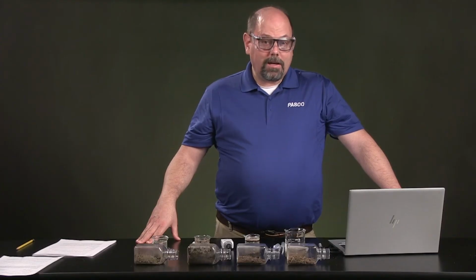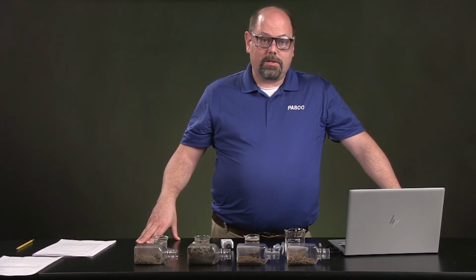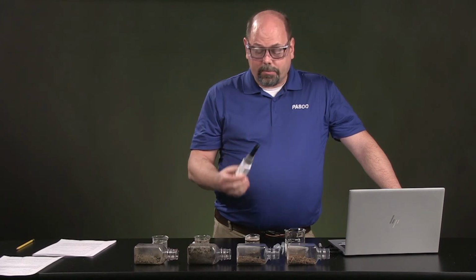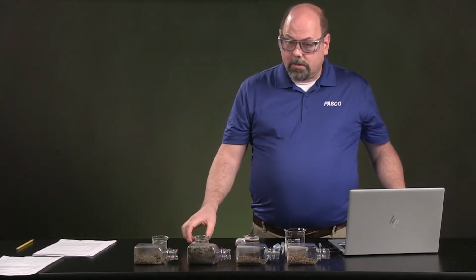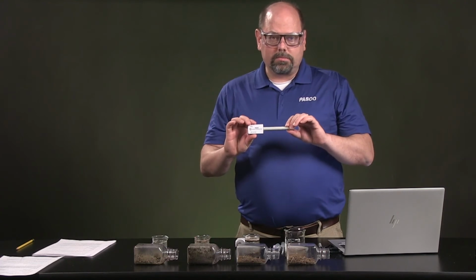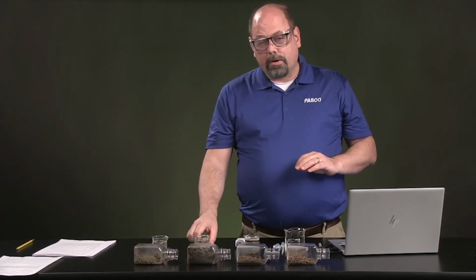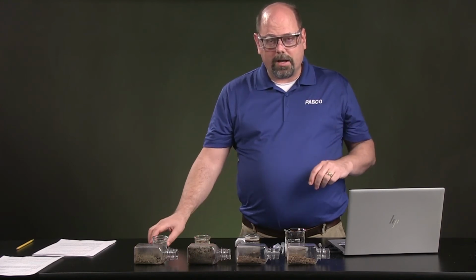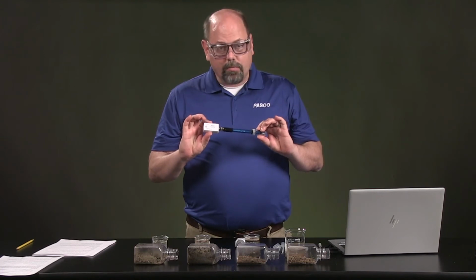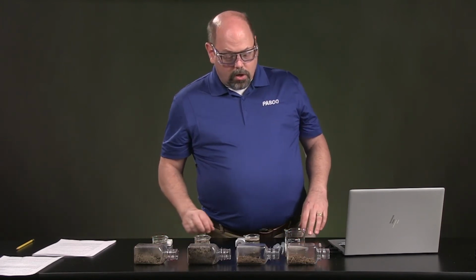We've gathered all the data about the materials, the processes, and the properties of the soils that we've seen. Using carbon dioxide to determine what kind of life processes are going on and the respiration that's happening for those decomposers and small bugs in the soil. We've used the conductivity sensor to determine what minerals are dissolvable; ionic compounds and things that can dissolve in the water are going to show up in those. And then we looked at the pH as well of the soils that we mixed with water.